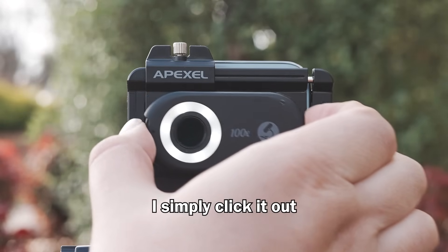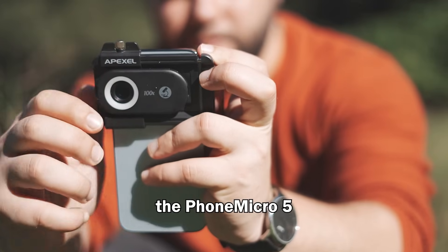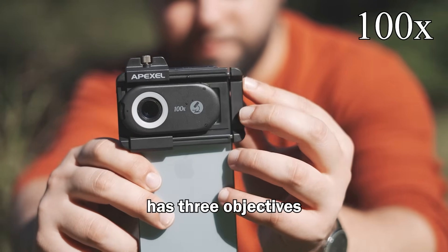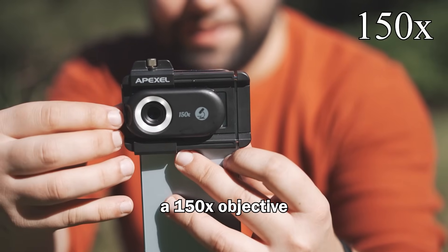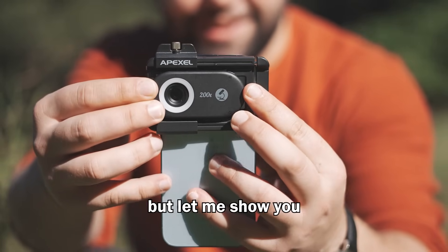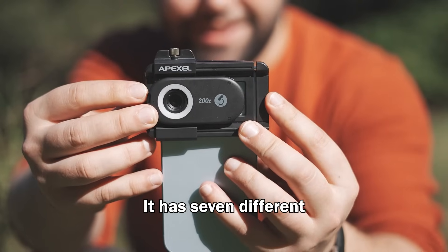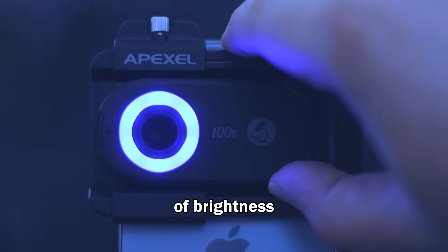And if I want to change objective, I simply click it out and fit a new objective in. The Phone Micro 5 by Apexel has three objectives: a 100x objective, a 150x objective, and a strong 200x magnification objective. It also has a really cool feature — seven different lighting modes, including UV, and each mode has three levels of brightness.